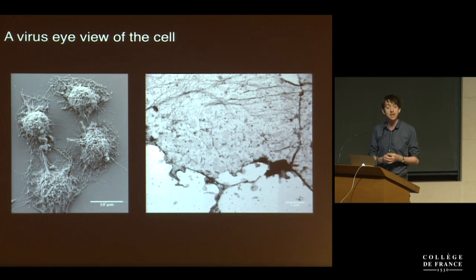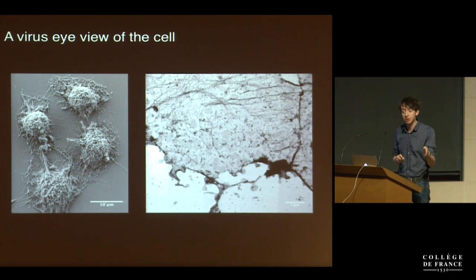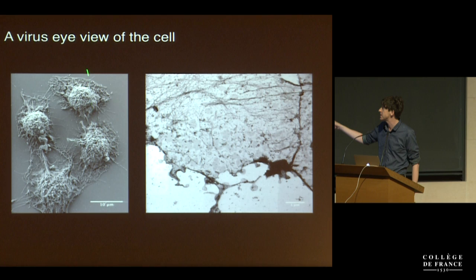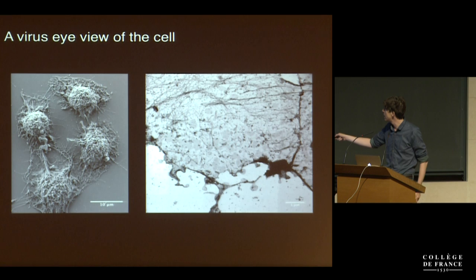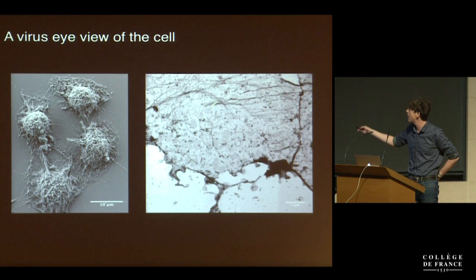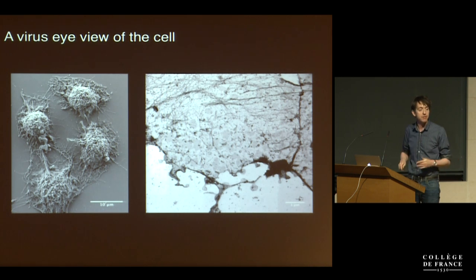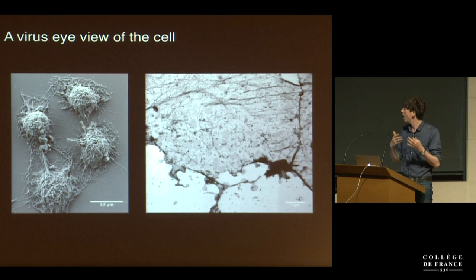For instance, we can take cells grown in culture and hit them with a blast from a sonicating probe or a jet of buffer and remove their cell bodies, just leaving the adherent plasma membrane intact. This can then be viewed by electron microscopy en face, and that's what's shown here. This is an adherent plasma membrane sheet from a HeLa cell, and we're looking now onto the cytoplasmic face of that membrane. And I'm going to play a video in which we zoom into this surface, and I think you'll agree that there's some eye-catching features apparent.